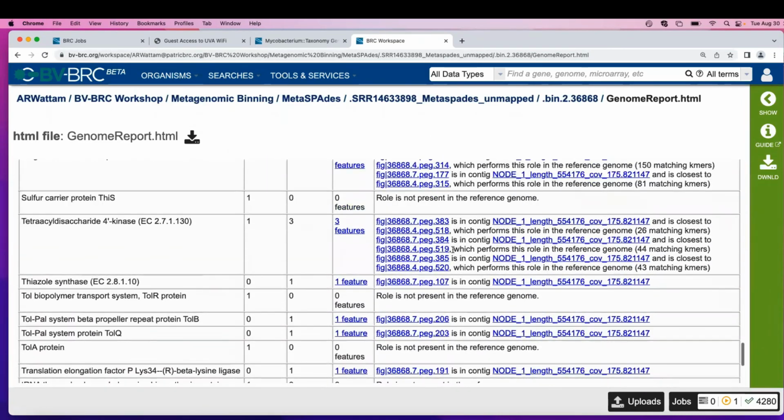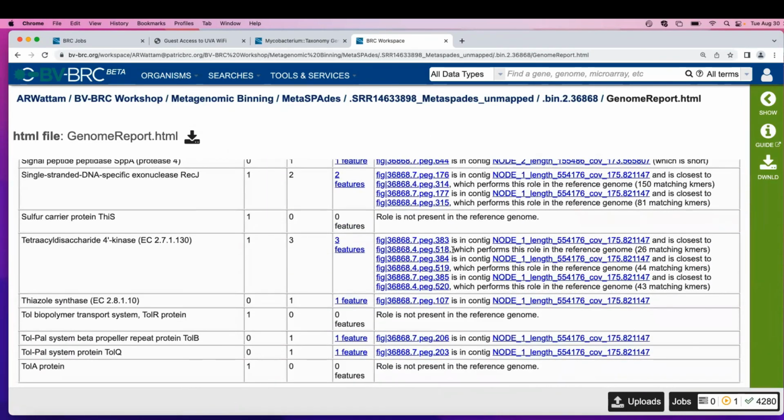This is actually a pretty nice genome as far as the quality of it. What you'll see in some of the genomes that are worse assemblies is that you'll get entire contigs that are clearly not part of this genome that got binned in for whatever reason. That will show up as all the genes on this contig don't belong. And so if you're doing a nice tight annotation, you probably delete that contig from the genome. Just pull it out.